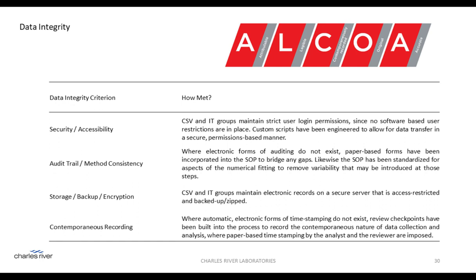Increasingly, the expectation is that the principles of so-called ALCOA, attributability, legibility, etc., illustrated here, are being held to for any assay, but certainly for those assays that are to be used for lot release or on clinical samples. Can the electronic records of an AUC assay attain these goals?